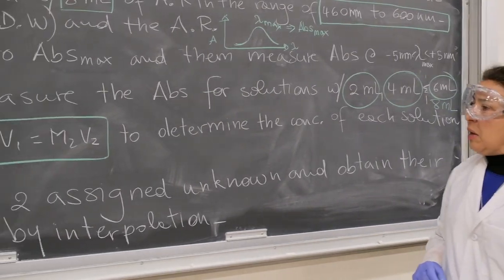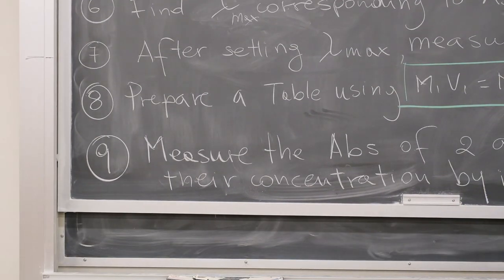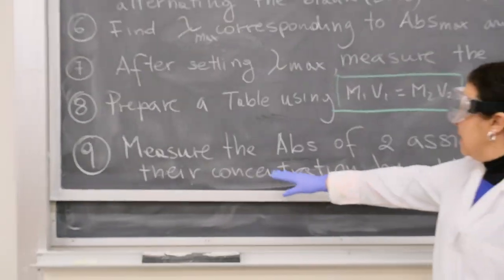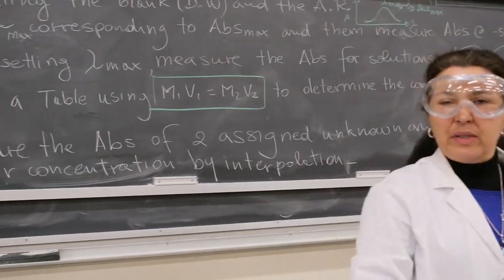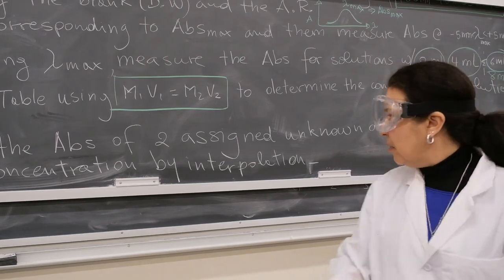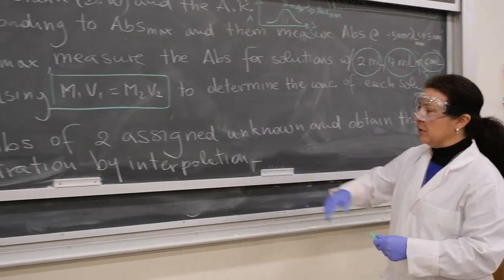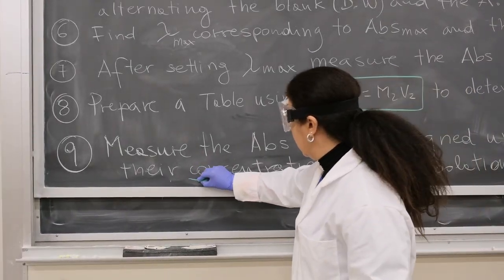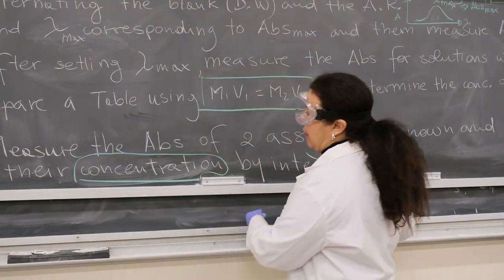Okay? Then, as a last step, you measure the absorbance of two unknowns that I'm going to assign you. Okay? They're here. And you will obtain by interpolation the concentration of the two unknowns. Let's see how we do the calculation.